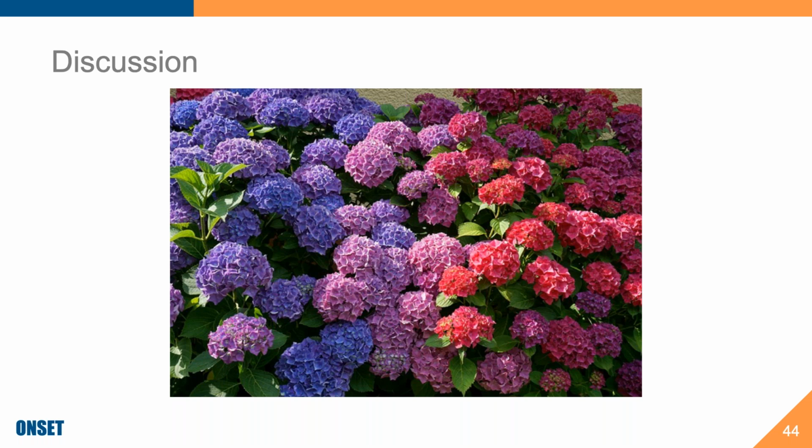So you'll start seeing the drift. It'll be pretty obvious, or you'll see something that looks like drift, and then you'll go and calibrate, and then find out it's maybe not drift, but it's actually your sample. So it's good to keep on top of that and be aware of that. So we do recommend every 7 days, but it is really application specific.